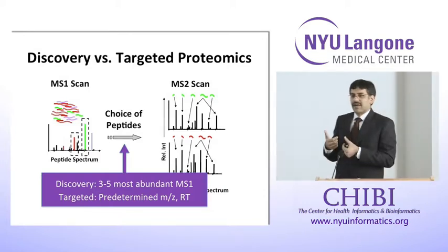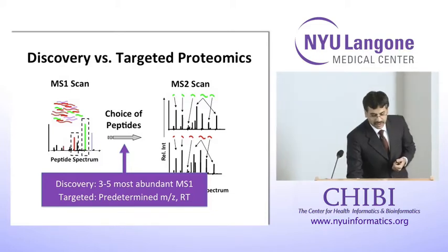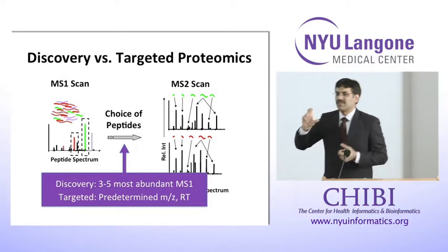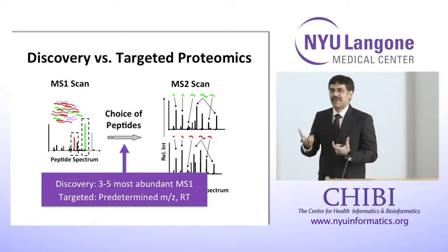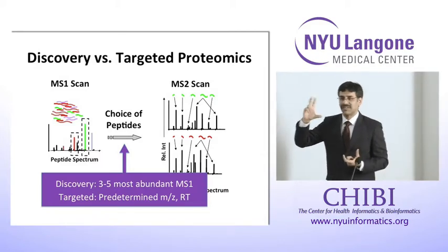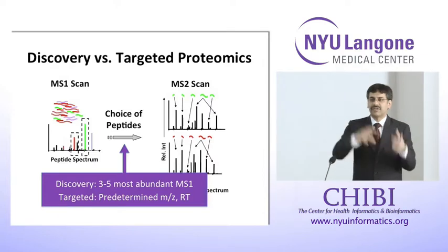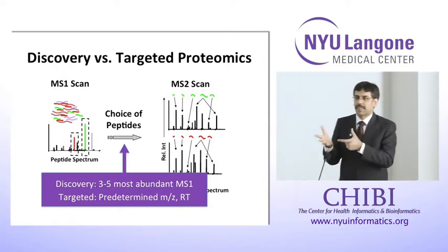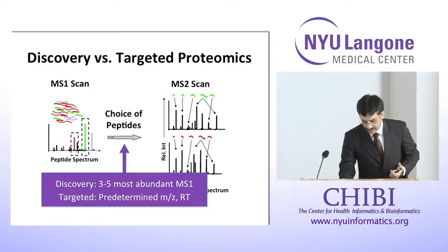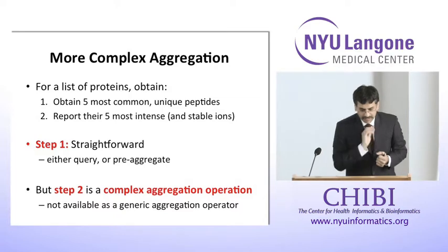In terms of fragment ions, we should observe abundant fragments. So in the MS2 stage, we should observe abundant fragments, and those fragments should show stable fragmentation patterns. It should not happen that sometimes they're very low in intensity, sometimes they're very high in intensity. They should have some stability in patterns. And that's how we can accurately determine the actual abundance of the protein in the end, the analytics part. So yeah, those are the 2 steps.